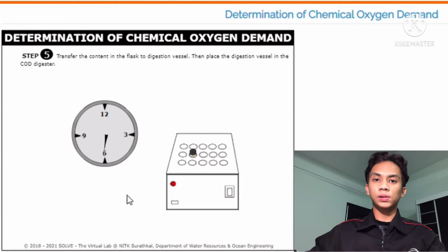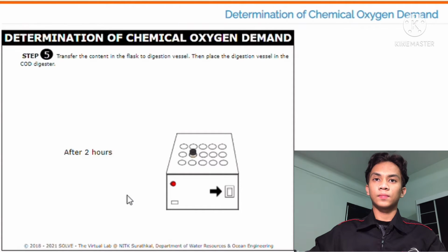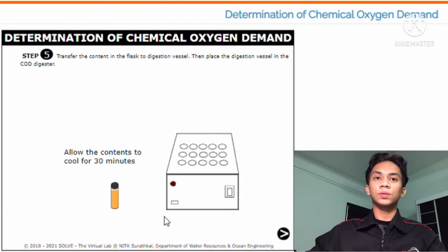Waiting for 2 hours. Then take it out. Allow the contents to cool for 30 minutes.